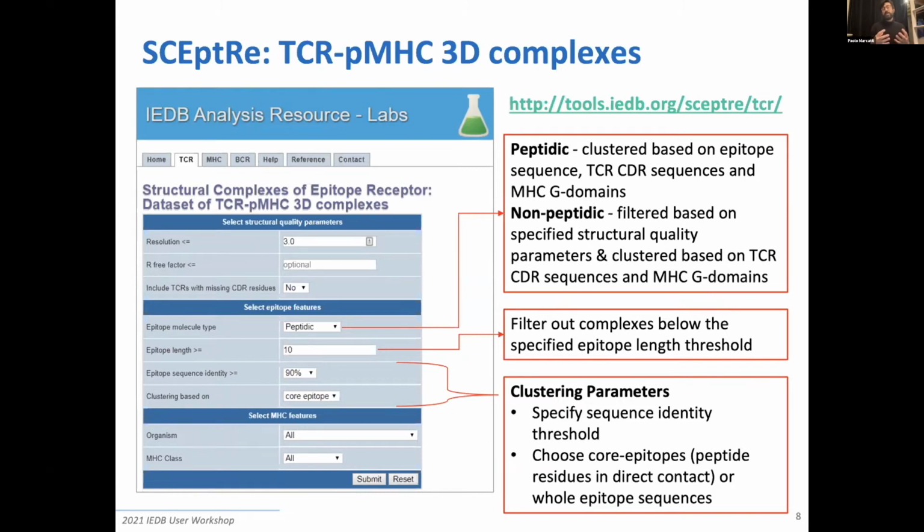And they are less good when we move farther from that. So it's a good way to understand the data that we're looking at and how well we can have rules or analysis that generalize to many different peptides.